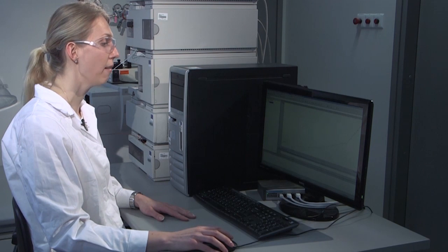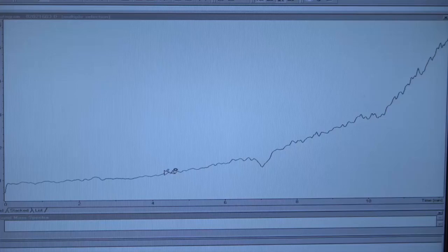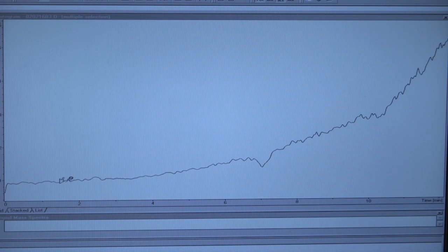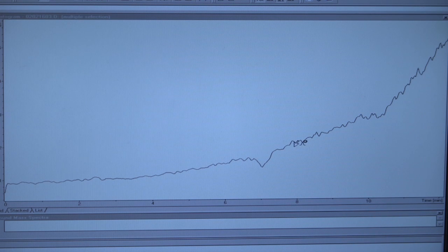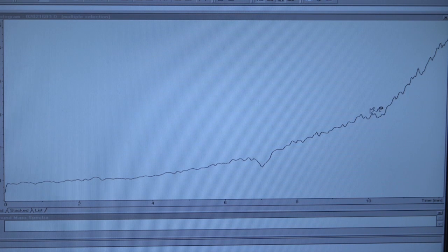Here we have the chromatogram that corresponds to the injection of solvent, and we can see that the signal is nice and steady, somewhat increasing due to the increasing ionization efficiency with the increasing organic solvent content in the eluent with the gradient.